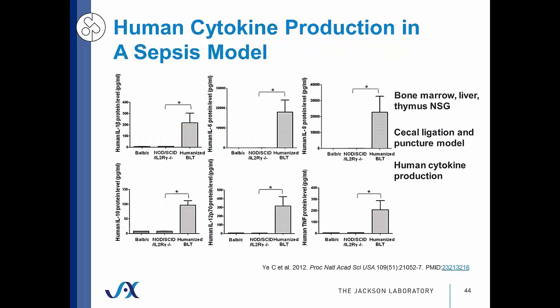Sepsis is a major health concern, and although it can be caused by systemic infection of viruses or fungi, bacteria are the most common contributors. So sepsis is commonly modeled in mice via a cecal ligation and puncture technique, which releases any cecal-associated pathogens into the sterile intraperitoneal cavity, and this is typically dominated by bacteria. So doing this triggers a systemic inflammatory response and the release of cytokines known as a cytokine storm.